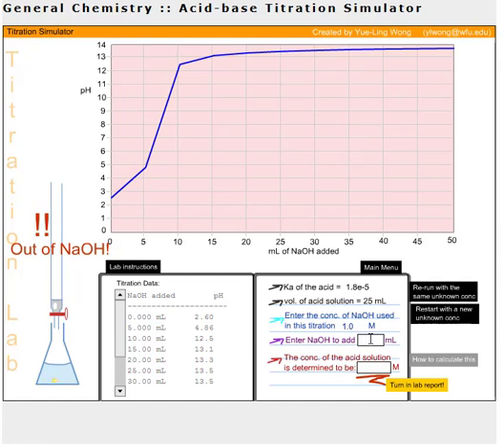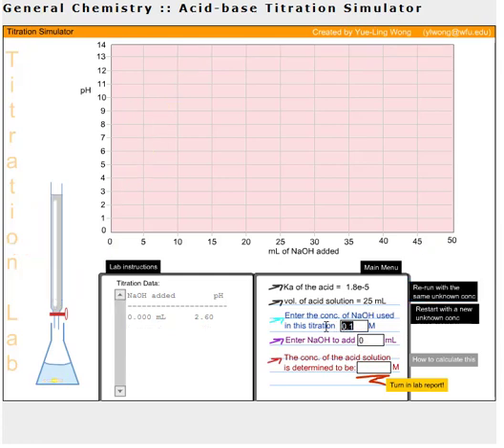So we're going to go ahead and reset. We're going to rerun with the same unknown. Make sure that after you've done your fast titration, rerun with the same unknown concentration. So we're going to change this to 1 molar again. But this time we're going to do 1 milliliter increments. And you could go smaller if you wanted to. So being that close to the beginning, maybe you want to go with a half milliliter.